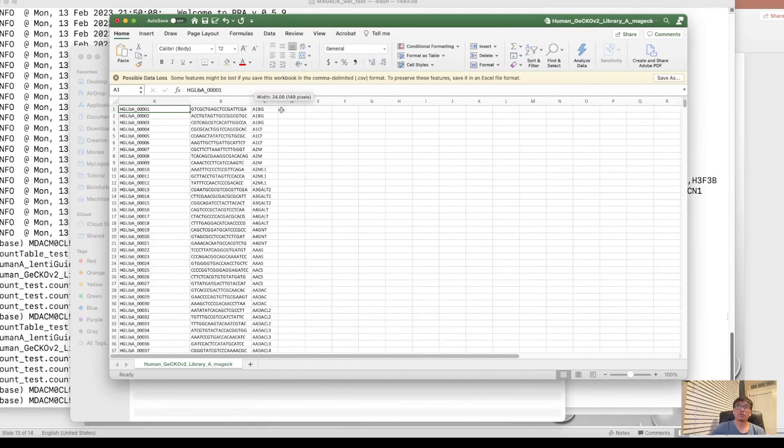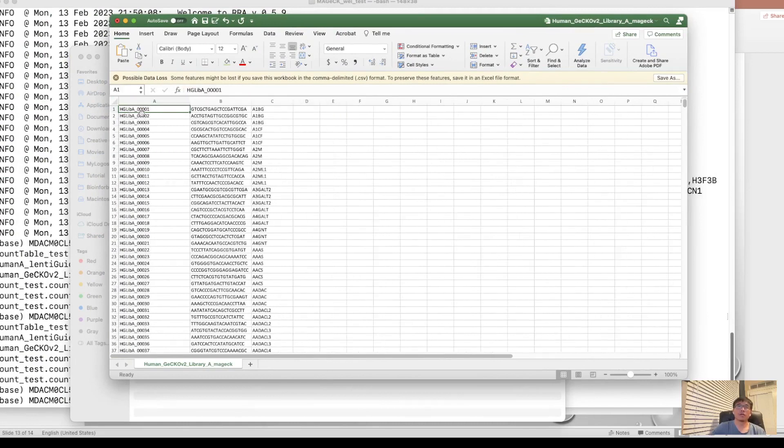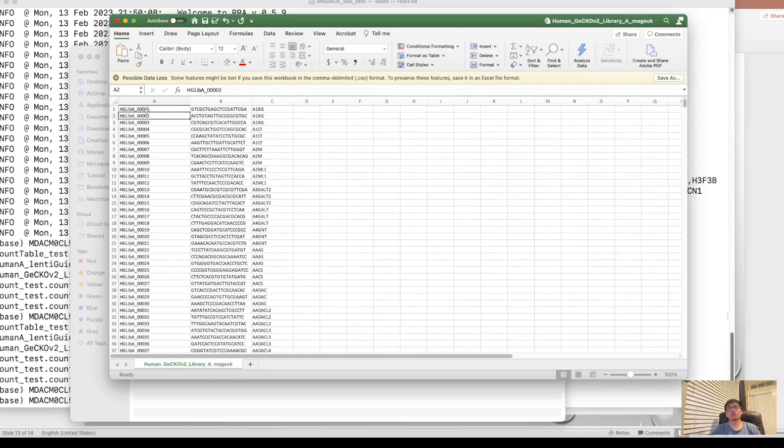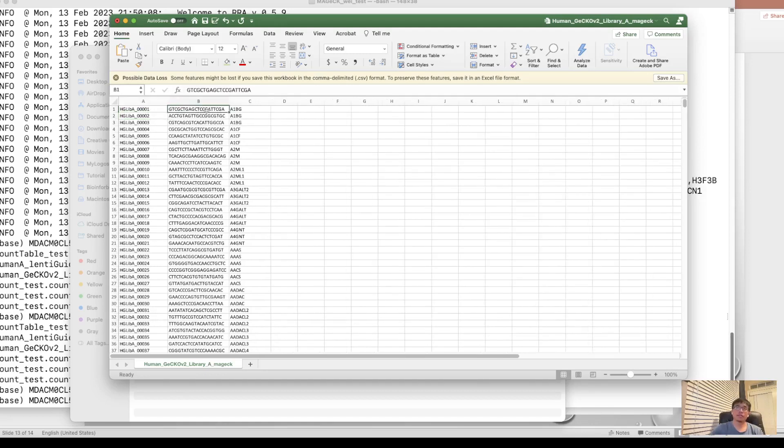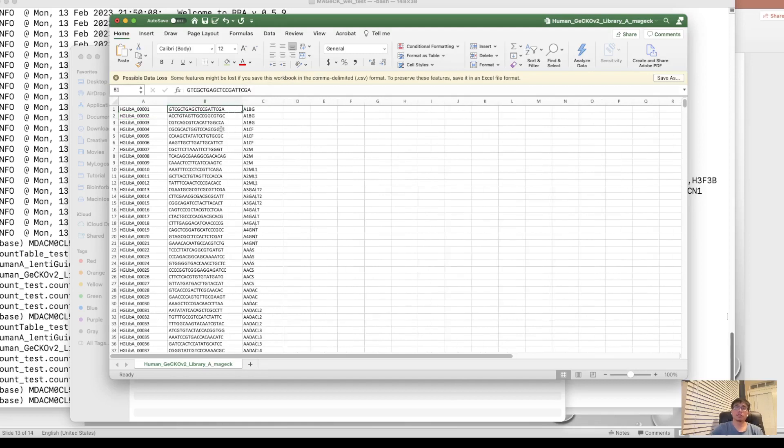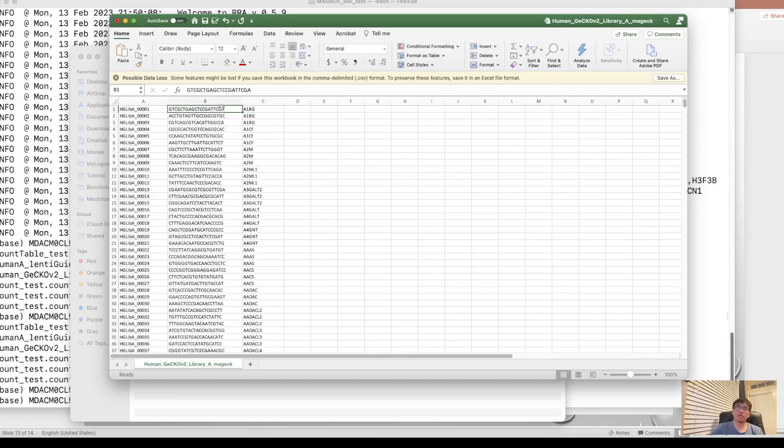The library looks like this. So it has three columns. The first column is the guide ID. So you can see hglib1 there, number one. You can also name by yourself like SG1, SG2. It doesn't matter. And the second column is the sequence of sgRNAs. It's a 20 base pair. And the third column is the gene symbol that the sgRNA targets.